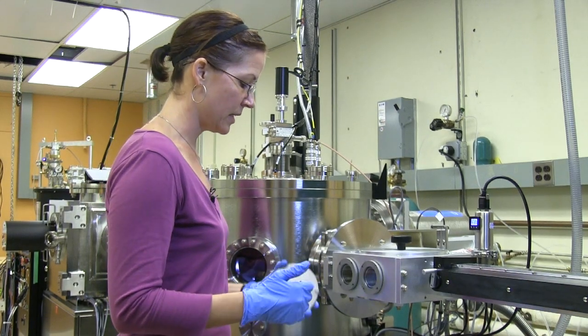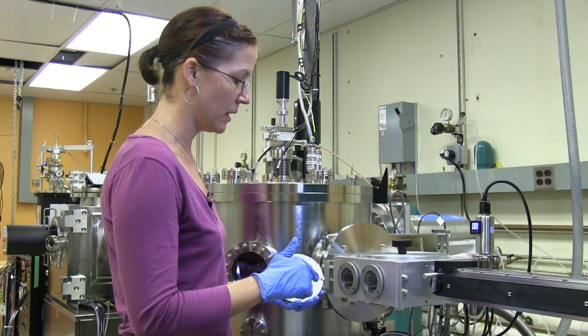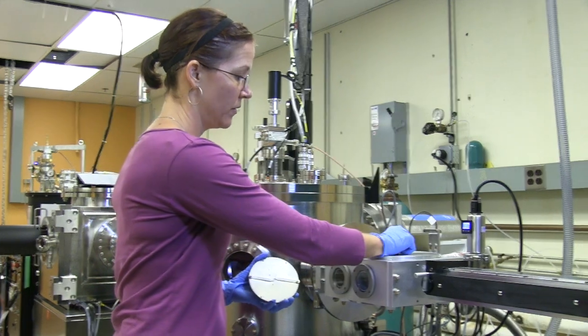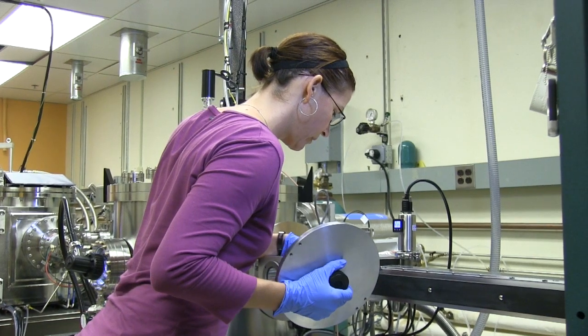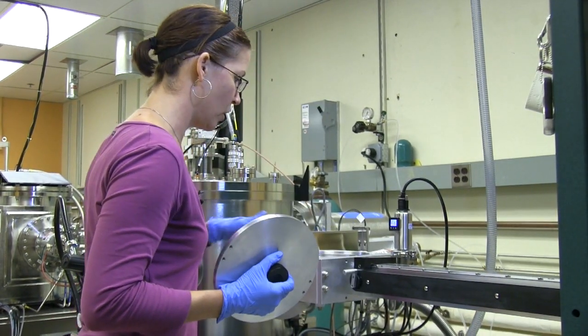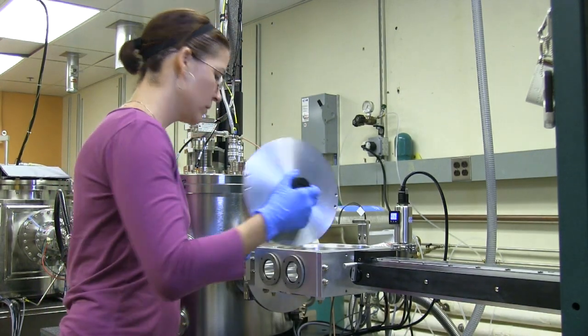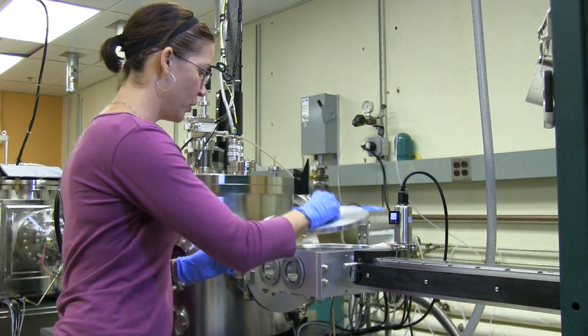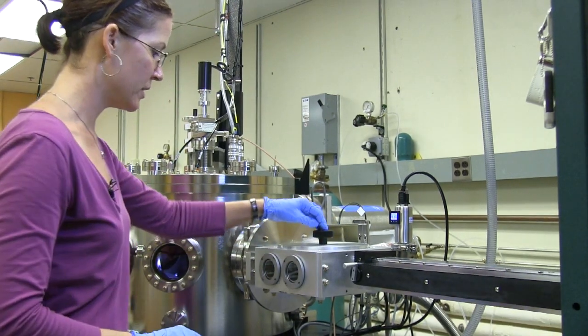So now we're going to put this sample that's loaded into the load lock. Very simple — just make sure it's lined up correctly. It's also important to make sure the O-ring is clean, and so is the lid before you put it back on, so that there's a very good seal.